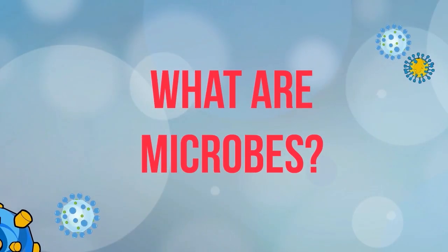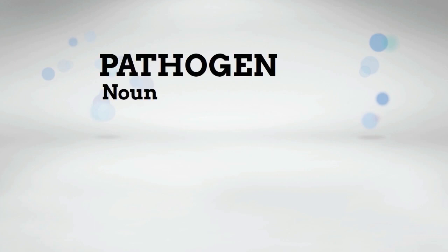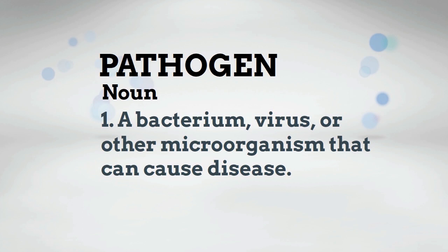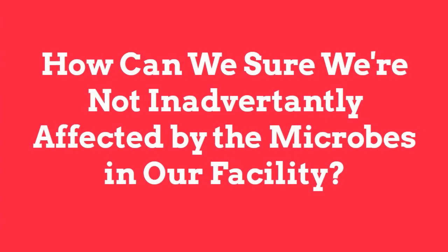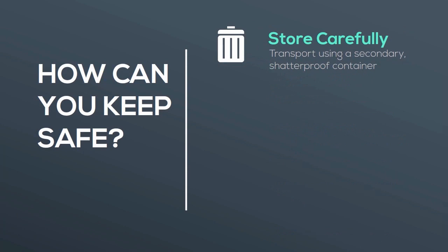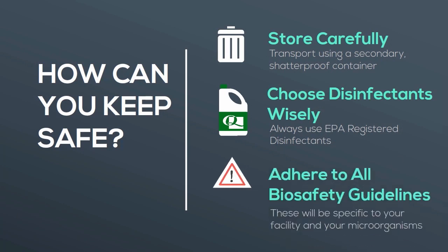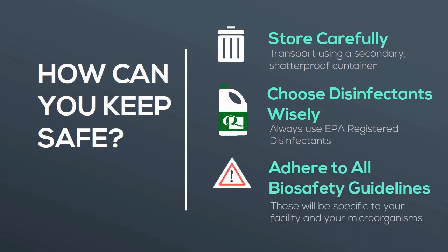Let's move on to microbes. Microbes are things like bacteria and viruses that are too small to see with the naked eye, and they exist on every surface and in every environment on earth. At Quiplabs you'll often hear us refer to pathogens, which are just microbes that can cause diseases. To keep ourselves safe, we need to be careful when storing and transporting biological materials, using secondary shatterproof containers where necessary, using EPA-registered disinfectants and sterilants with label claims for the specific bacteria and viruses we're targeting, and adhering to all biosafety protocols required for our facility.